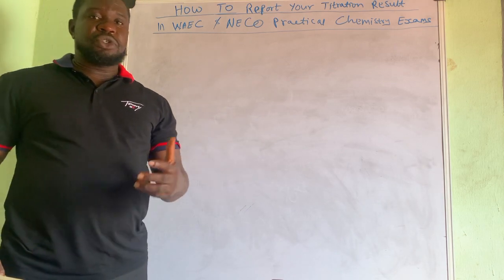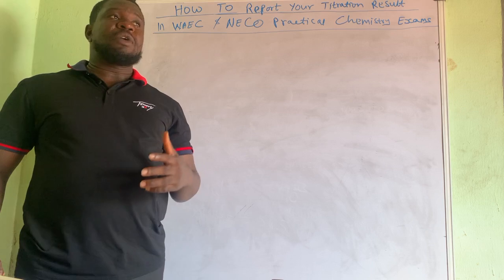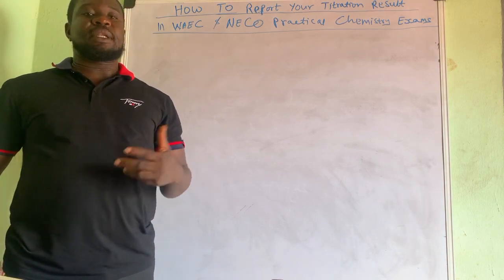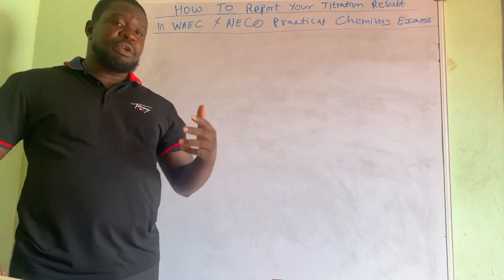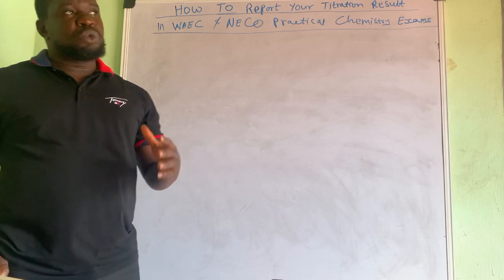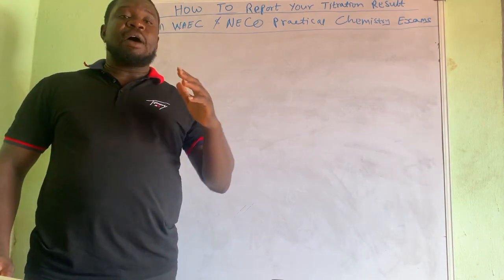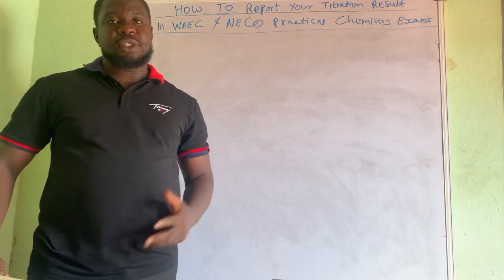When you do your titration, how do you report it? There are ways that you report it that will be unclear, and you begin to lose marks. But there are other ways that when you report it, everything would be clear and the examiner will be able to award you your full marks in your practical work.